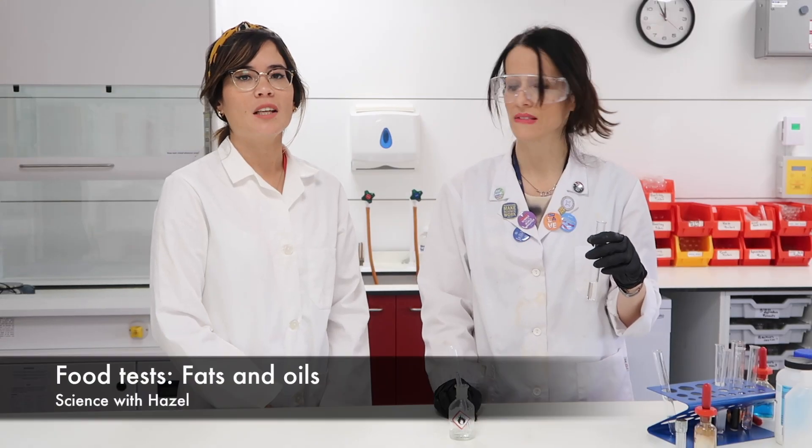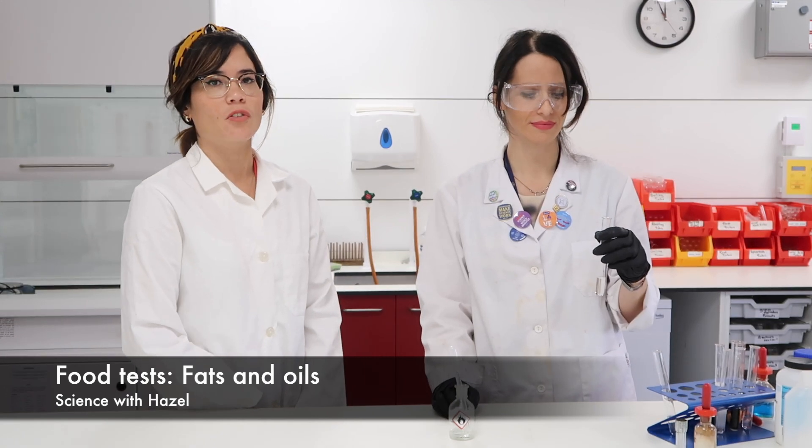In the final food test, Amelia and I are going to show you how to test for fats. It's a nice straightforward test.